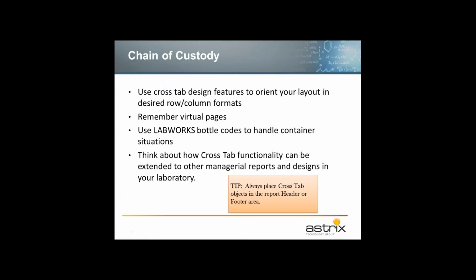So, chain of custody conclusions. Use the crosstab design features to orient your layout in desired row column formats. Remember those virtual pages if you have data sets that spill over to other pages. Use LabWorks bottle codes to handle container situations where maybe you have certain analysis coming out of certain bottles.